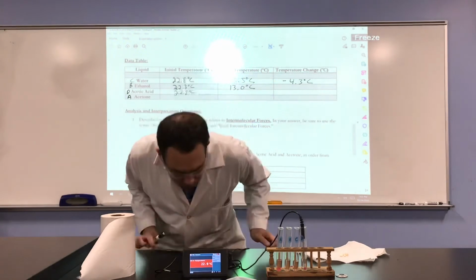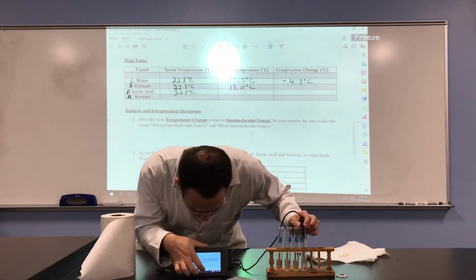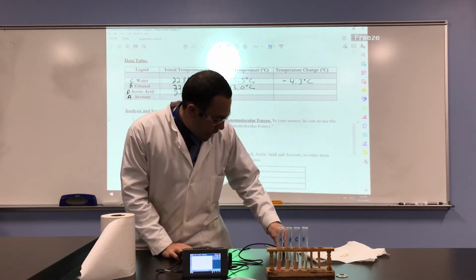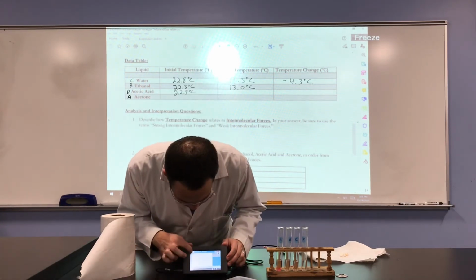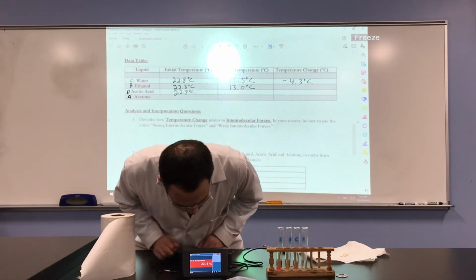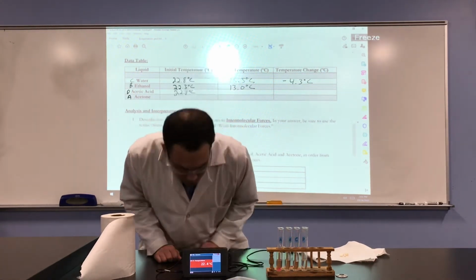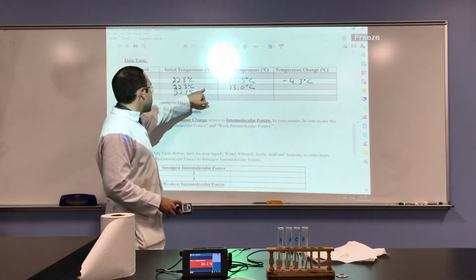We'll remove the probe from the test tube. Click play. Discard all data. And place the probe at the edge of the lab bench. So we already dropped down to 22.6, 22.4. But while we wait, we don't have to sit and wait for 3 minutes. We can do the subtraction from before.